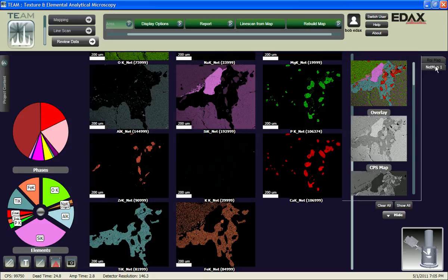All right, so that concludes our presentation on how we can rebuild maps in the TEAM software. Thank you.